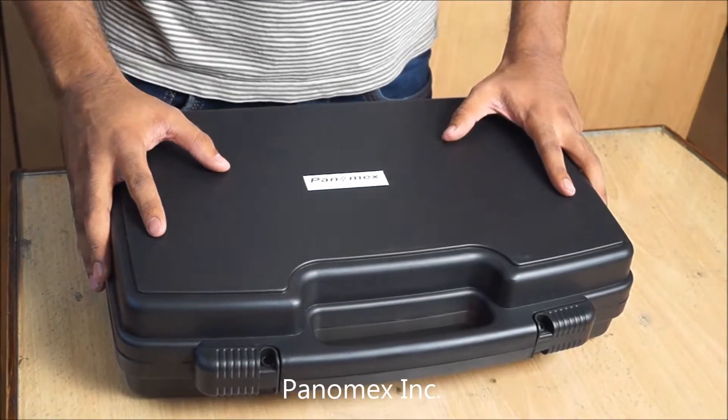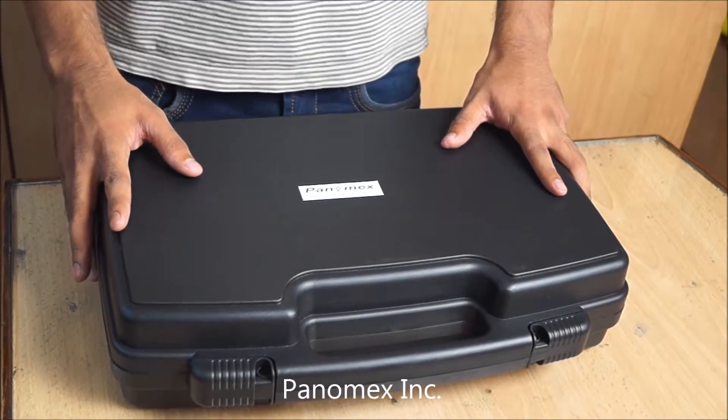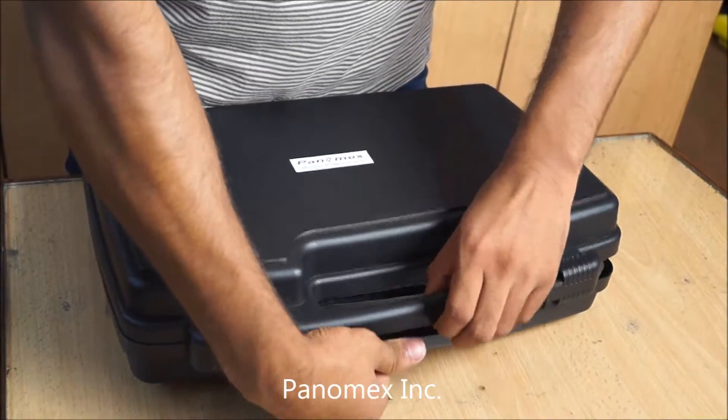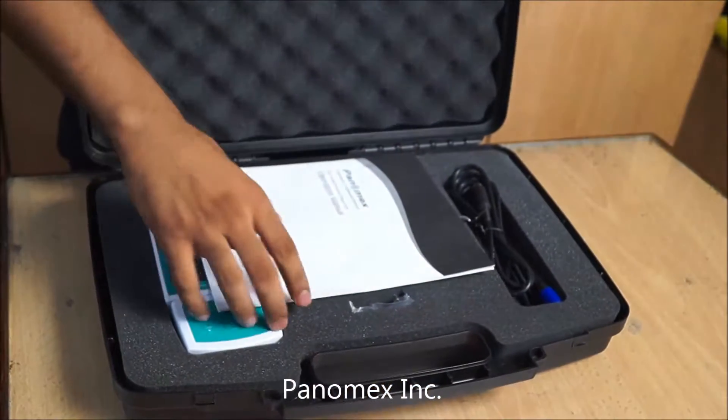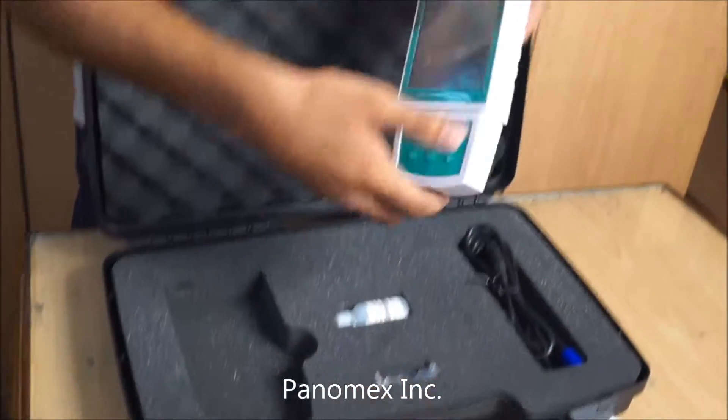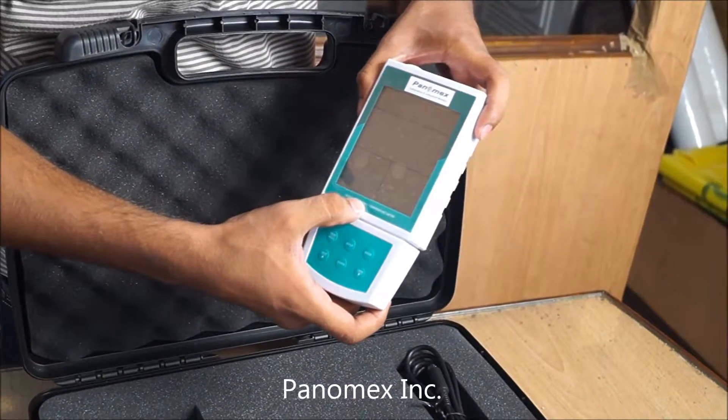Welcome to Panamax. Here is our new product: the Portable Dissolved Oxygen Meter.